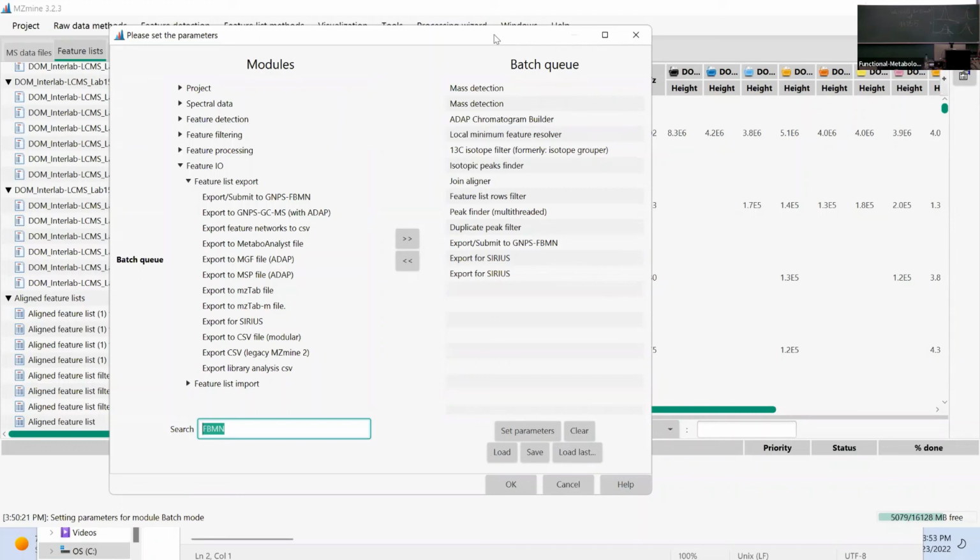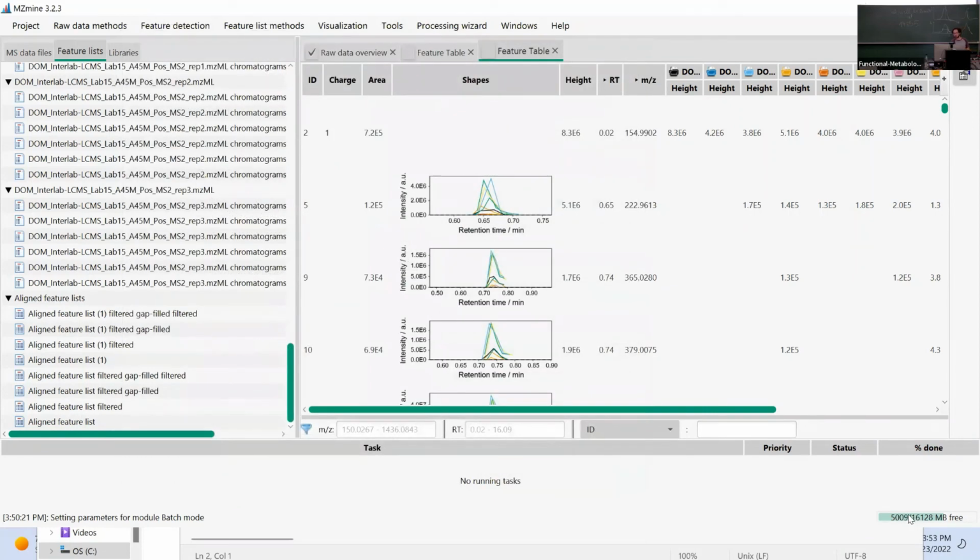I mean, you typically want to keep the raw data in MZmine. If you look at memory consumption by Java apps in the task manager, it doesn't really tell you the truth. So it might say MZmine is taking up 90% of your memory, but it's actually not doing that. It's lazily giving it back to the OS if the OS demands more memory. At least for MZmine, you can see it on the bottom here.